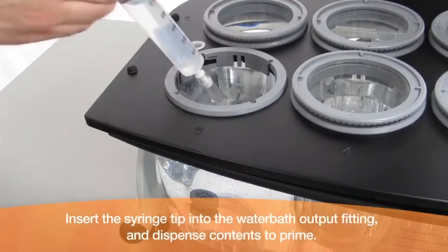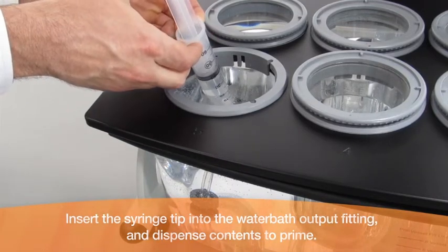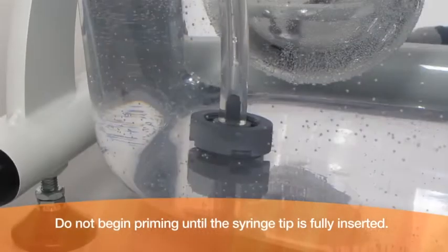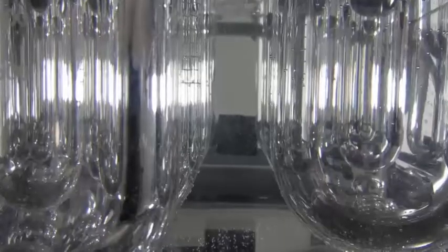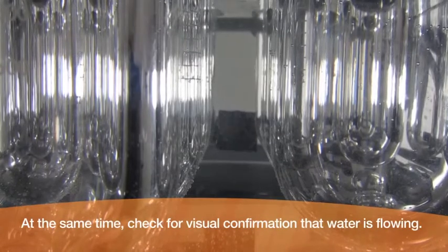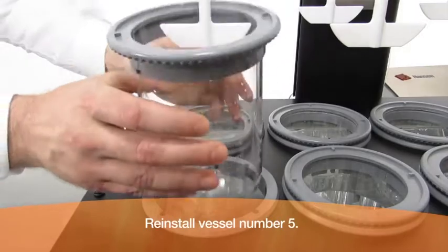Insert the syringe tip into the water bath output fitting and dispense contents to prime. Do not begin priming until the syringe tip is fully inserted. Repeat priming until a whoosh sound is heard from the pump. At the same time, check for visual confirmation that water is flowing. Reinstall vessel number 5.